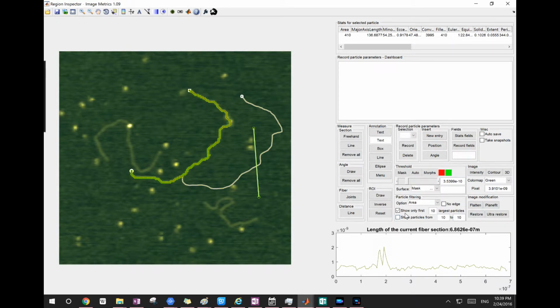So all I need to do is use the profile, and there are multiple ways to record the position. You can simply right-click the protein peak and say record position, and that's easy. You can click multiple places, right? You can also record position at a designated location. The designated location can be anything that's specified in the options here. Right now it is the maximum height. So if you click this one, it should mark that point because that's the maximum height there.